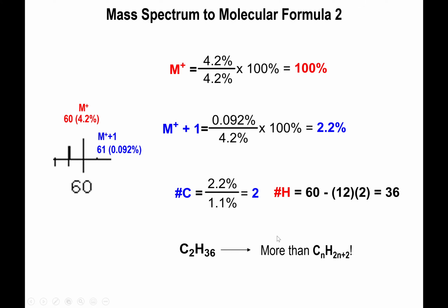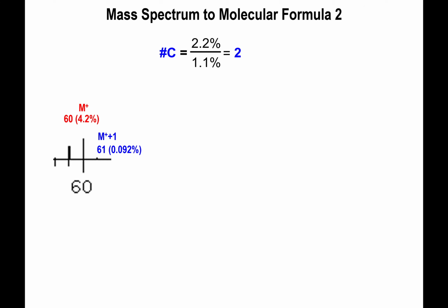So this is the deal. There are some elements that are missing. We might want to look at the M+2 peak, except that we don't have any. That creates a problem because if we don't have an M+2 peak, then there is no bromine, no chlorine, and no sulfur. However, the absence of the M+2 peak does not automatically negate the presence of oxygen. So we're going to see what happens if we start introducing oxygens into the formula, and take a look at the mass.